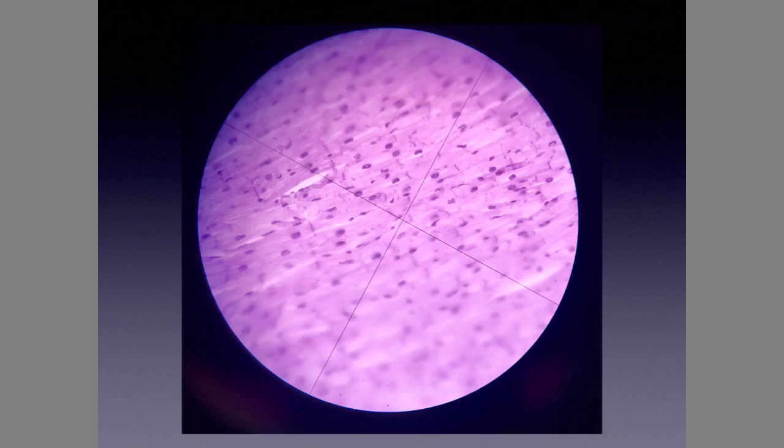Let's go ahead and begin. Slide number one is a slide of cardiac muscle, and you can see that it has that characteristic branching pattern and very characteristic intercalated discs. So this is a very unambiguous slide, and hopefully you guys did okay on this since this was a histology slide that you had to identify during the first lab exam.